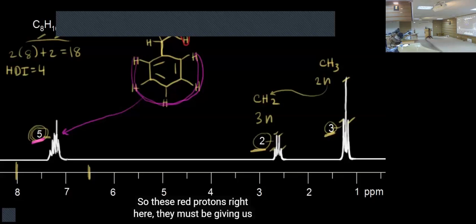Okay, so whenever you have this spectrum, looking at the triplet, this is the 3 protons. From the integration, this. Integration is the first thing you have done while processing. So these are the 3 protons, a triplet. Triplet means this signal is a triplet because of the n+1 rule. So a triplet means it has 2 protons beside it.